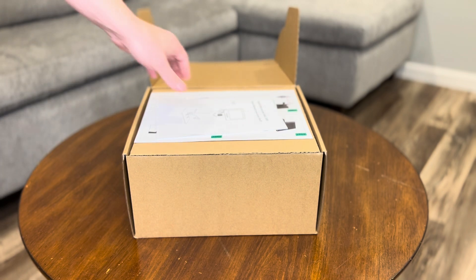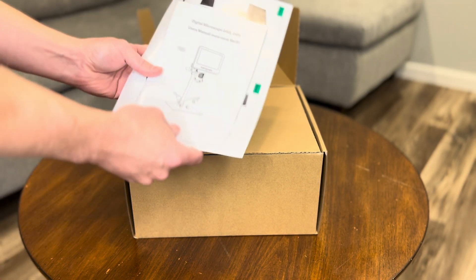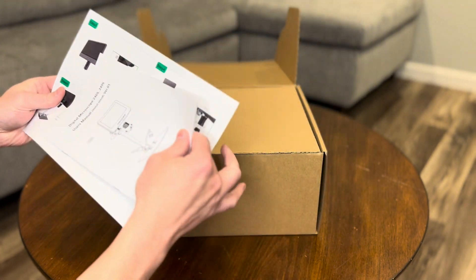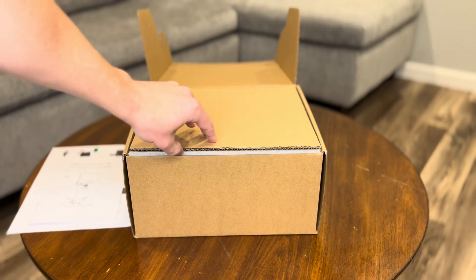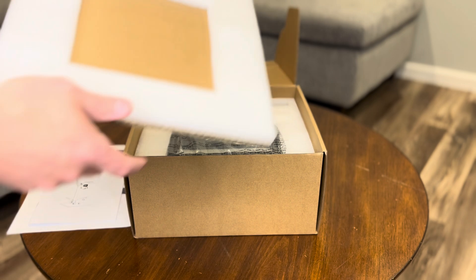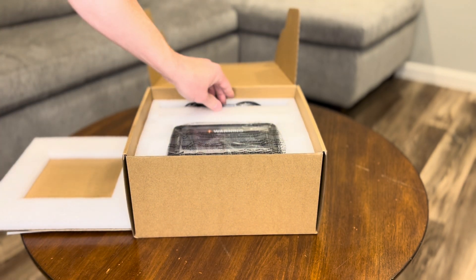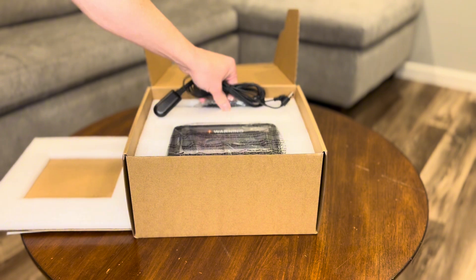As soon as we open the box, we see a few key components. First up, we've got the user manual, which is pretty straightforward and helpful if you're new to digital microscopes. It's always nice to have a clear guide for setup. And here we have some power cords, and right there on the top is the microscope itself.